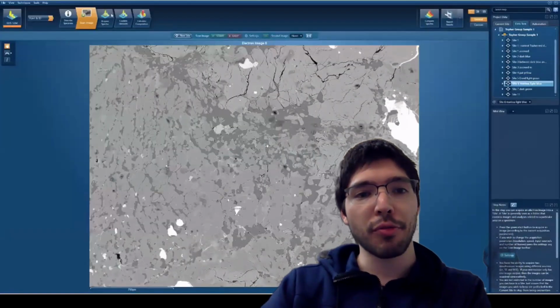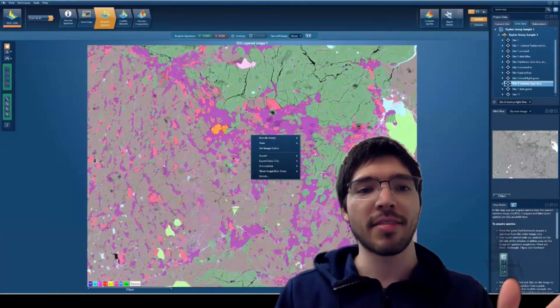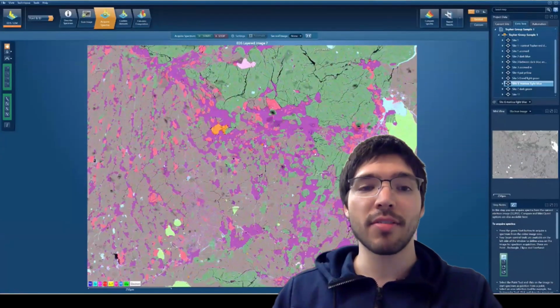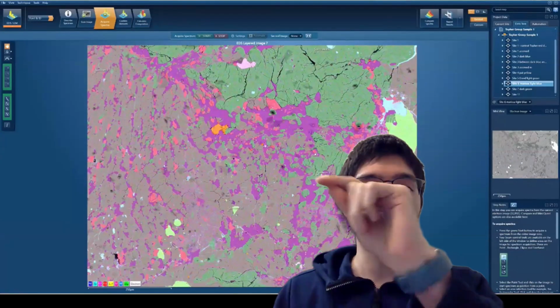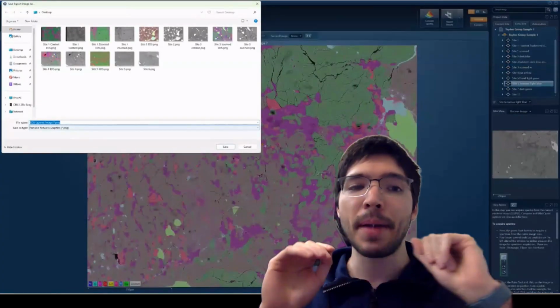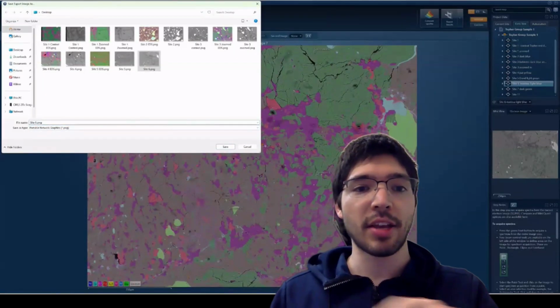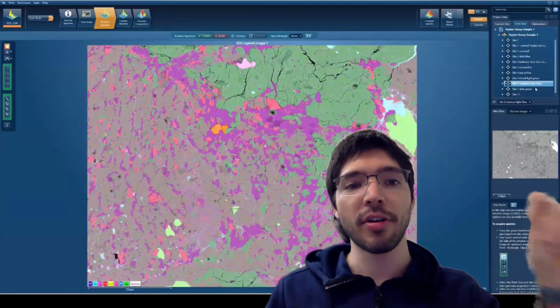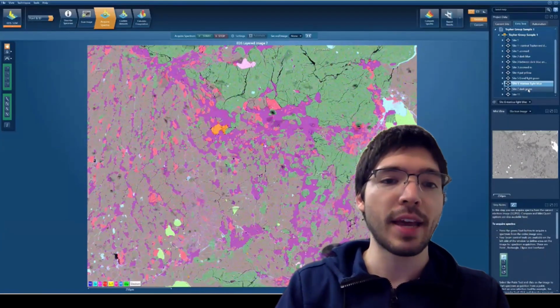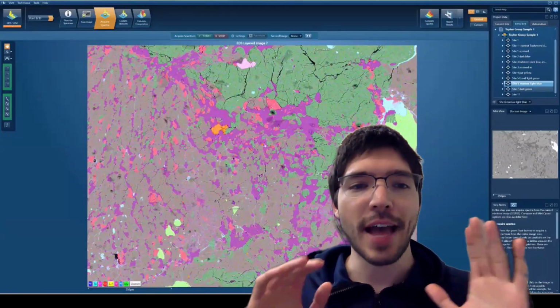We then process it through the software, and it can pick up different energy peaks and assign those to different elements. Say you have an iron peak right there, you have a magnesium peak here, you have X concentration of magnesium, X concentration of iron, based on how many of those X-ray peaks you pick up, so the intensity. And then it spits out a final number that says, based on your energy spectrum at this area, and what elements are in here, this is their concentration. Then you can use that to assign mineral phases to what element concentrations are in them. And there are different ways you can show the output. So that's really all we're doing here.